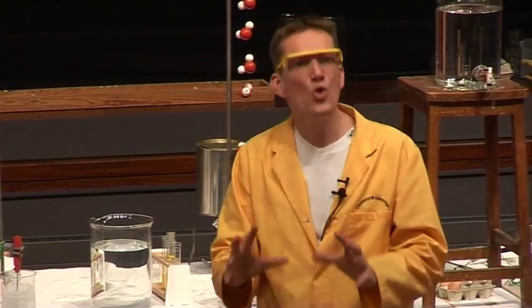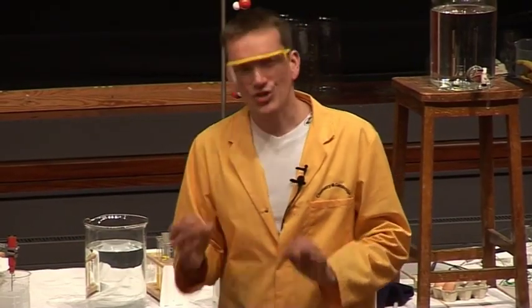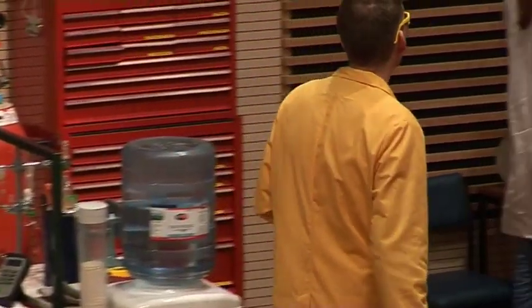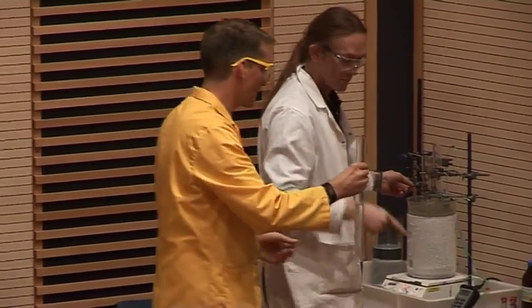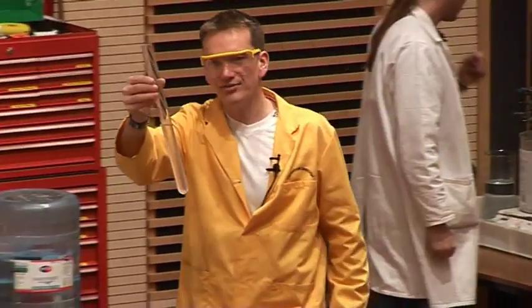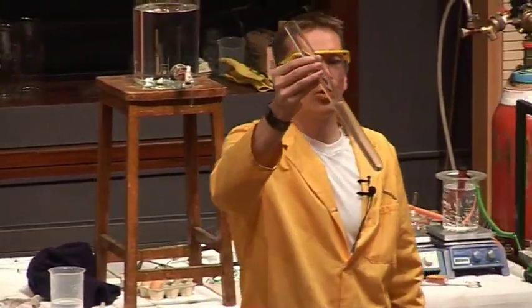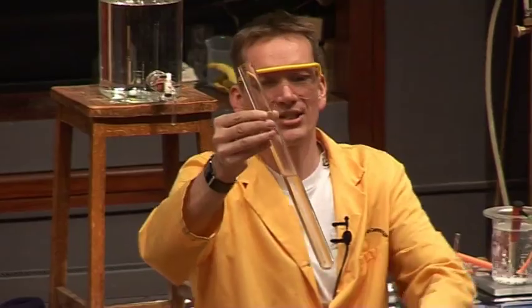Okay? Below 0 degrees, water should be ice. Well, it should be ice, but if we're very, very careful, we can actually make liquid water. We can keep the water liquid at temperatures less than 0 degrees. So I have some here. This is called supercooled water. So this water is actually at -6 degrees. So it's still liquid. We have to cool it very, very slowly and carefully.